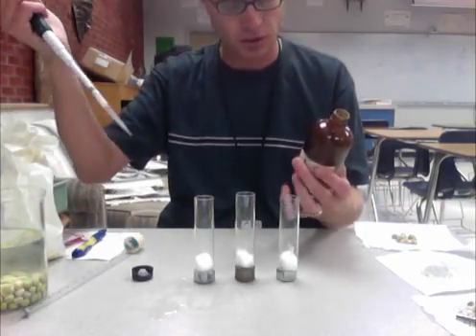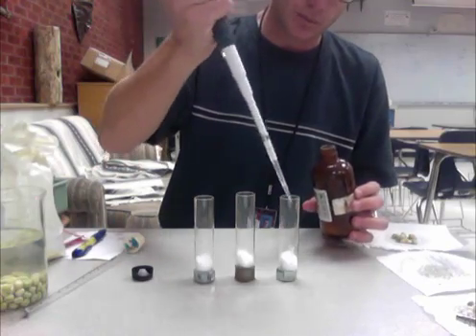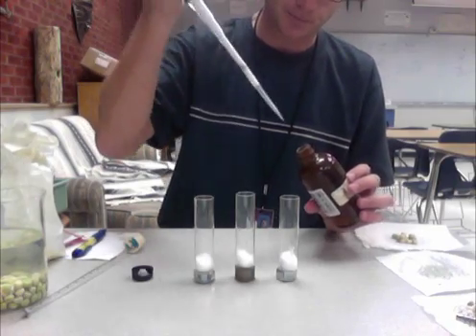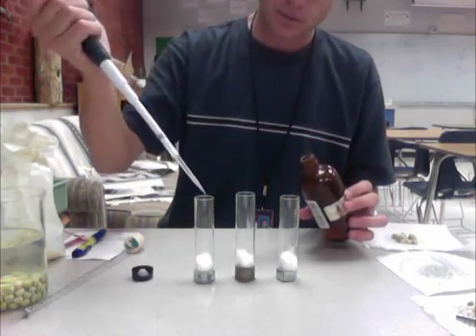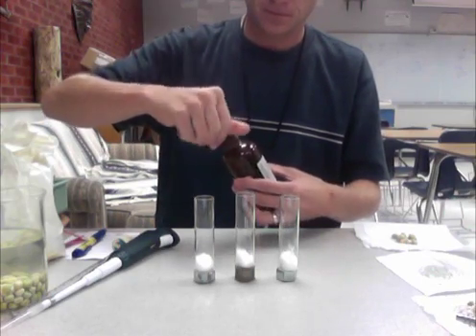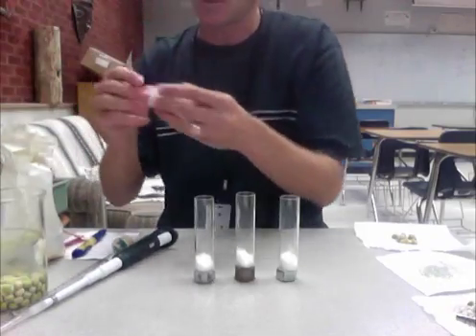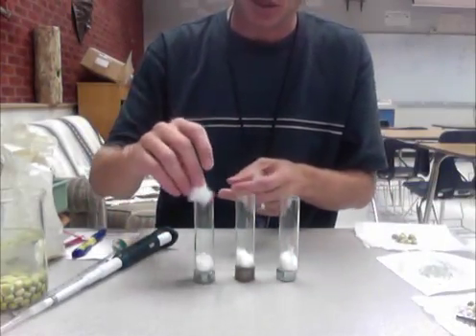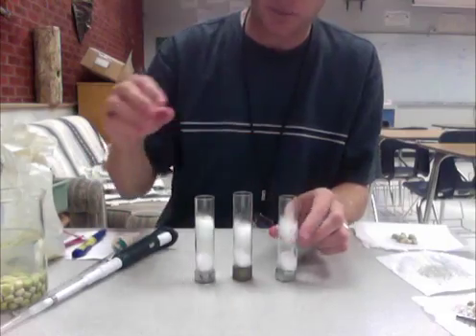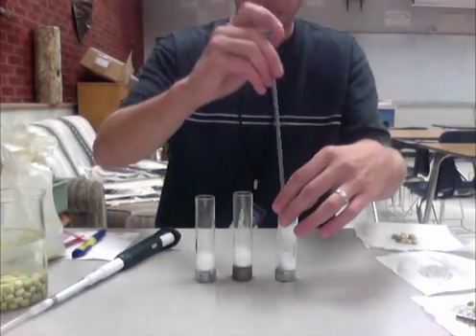Next, we're going to add potassium hydroxide to the bottom. Potassium hydroxide grabs onto carbon dioxide and turns it into a solid. This stuff is really nasty — it's a poison — so be careful not to get it in your eyes or hands. I'm going to take 500 microliters and put it in the absorbent cotton at the bottom, then seal it back up. On top of that, we'll add non-absorbent cotton made of polyester, putting about the same amount in each vial and pushing it down so the potassium hydroxide can't reach the peas.